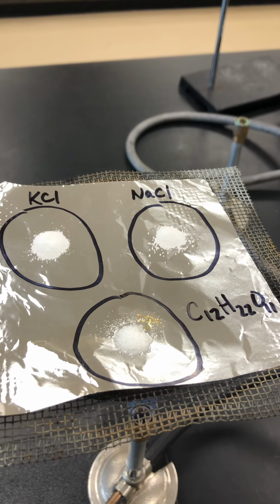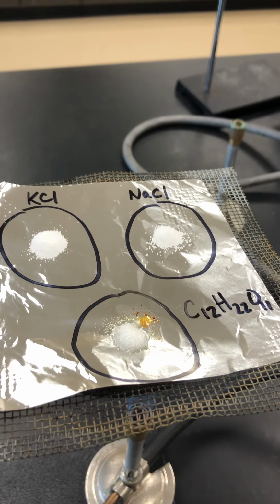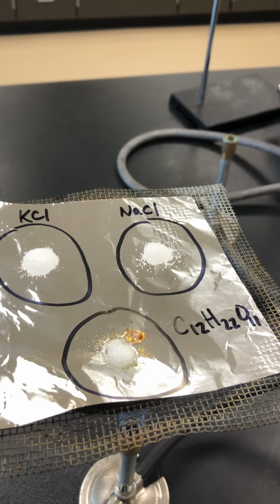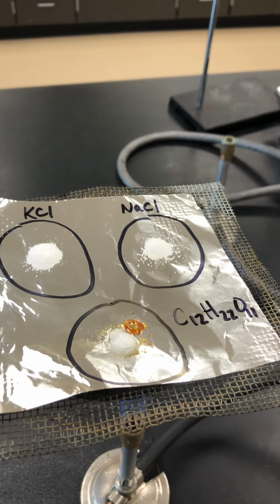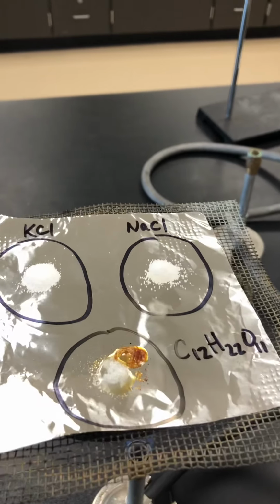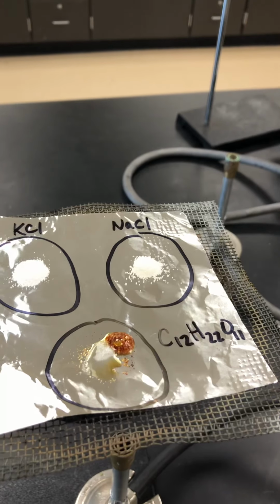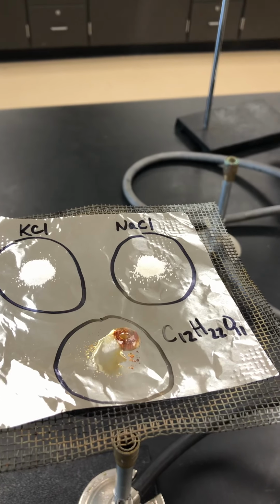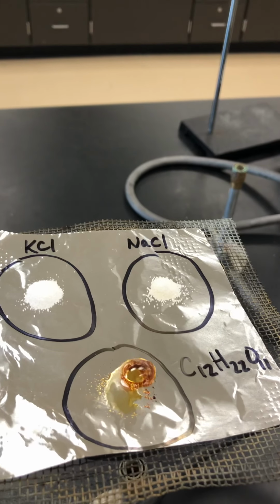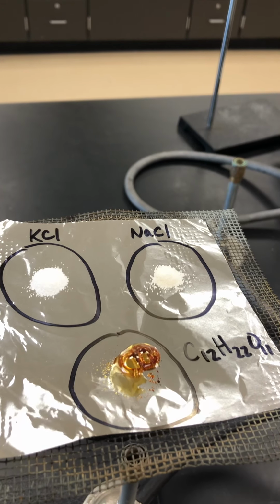So you can see that there's some melting happening with the one on the bottom. The other two at the top have not really changed at all. And so I'm going to go ahead and turn this off. So when I look at the results here, it seems like that bottom one melted, but the other two have not. So go ahead and record that in your data table.